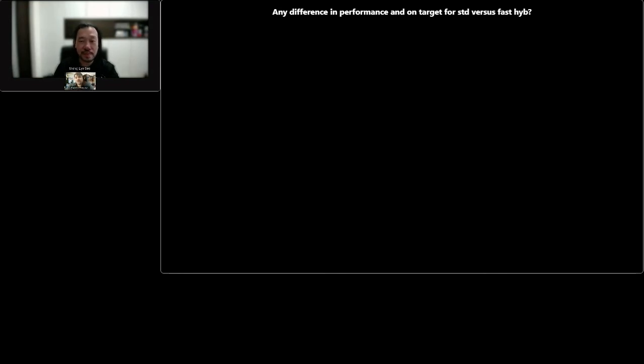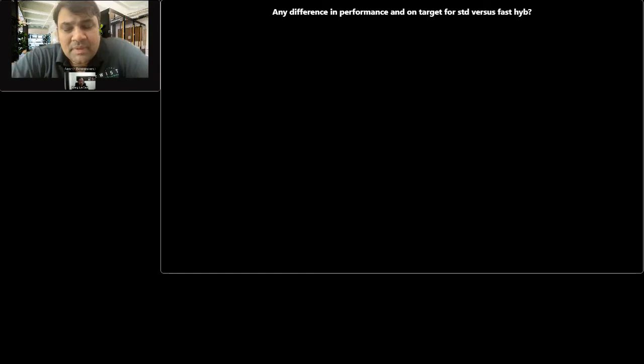No. The performance metrics are exactly the same for both standard hyb and fast hyb. The only difference you can encounter when using fast hyb is a slightly different AT dropout and GC dropout profile, because fast hyb was developed to expedite the entire process.